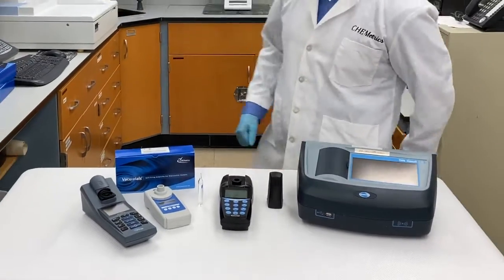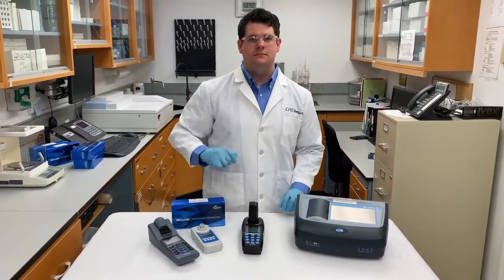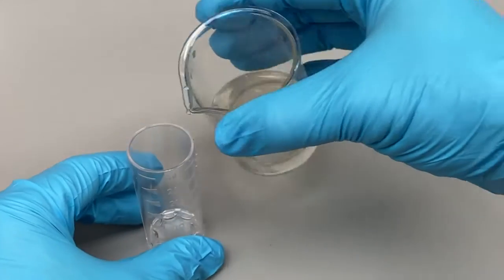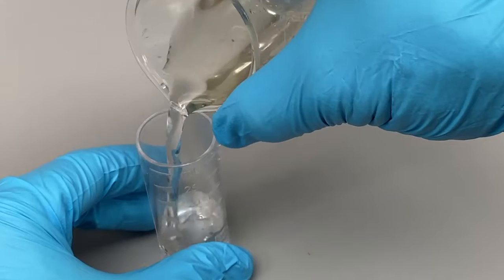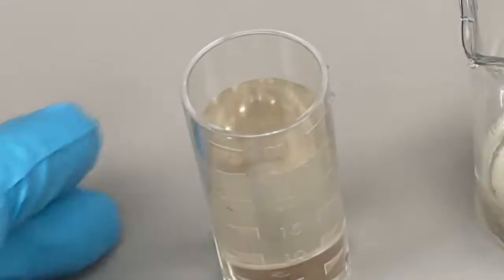Before a photometric instrument can be used to obtain test results, it must be set to zero. But if your water samples are colored or turbid, it's advisable to zero your instrument with the sample to improve the accuracy of your results.